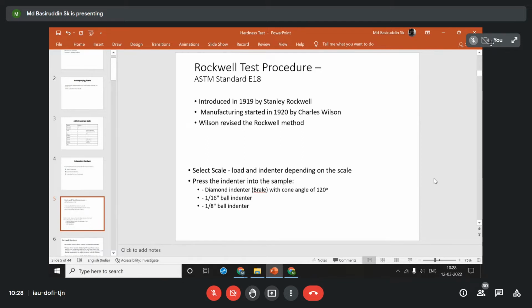First we try to categorize the materials primarily based on their hardness, like soft materials put together, intermediate hardened materials kept as medium hardened materials, and high hardened materials categorized in such a way that we measure the hardness by following the Rockwell C testing process, where we use the diamond indenter. For soft materials, we can use Rockwell B, following the Rockwell B testing process, where we use the hardened steel ball.